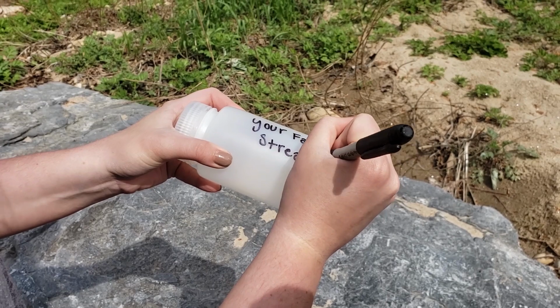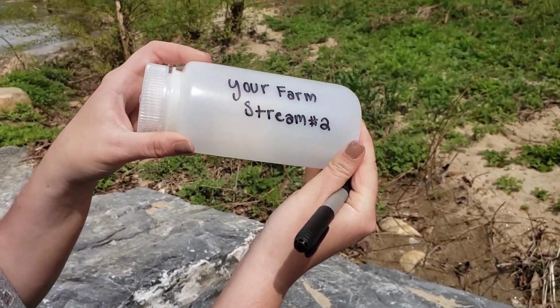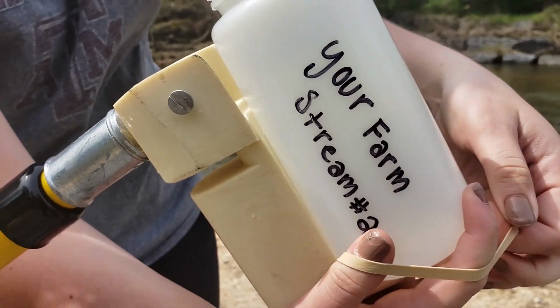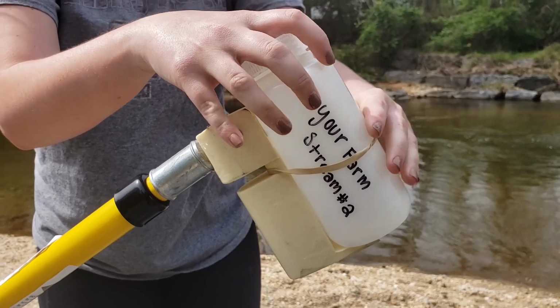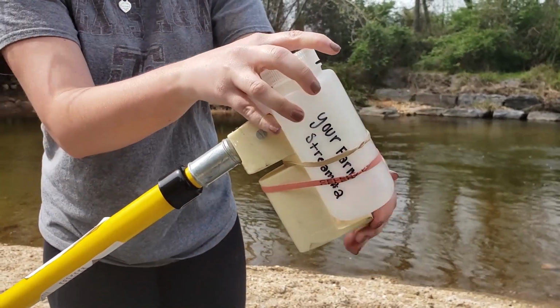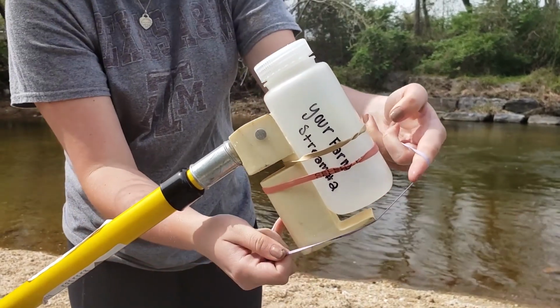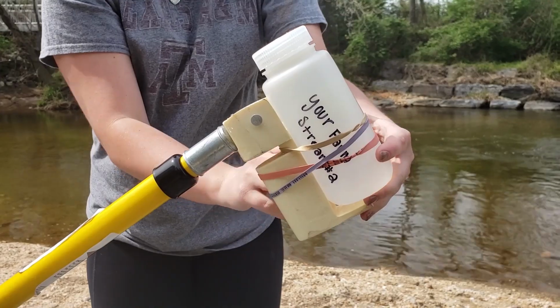Using a permanent marker, legibly write the name of your farm and your water source. Attach your sample bottle to the water sampler rod. Feel free to use a makeshift sampler as long as you can collect water close to the irrigation intake. Specific clamps are sold to hold bottles in place, but rubber bands can be a good substitute in a pinch.